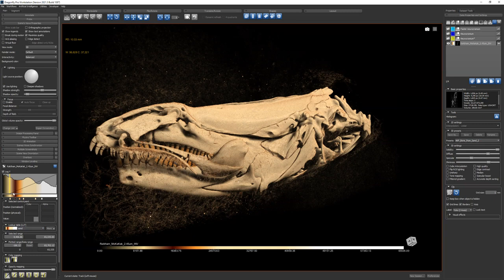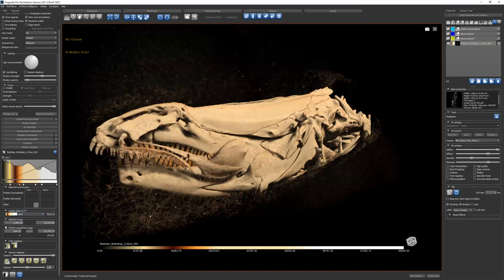But here's your not dense stuff. Here's your more dense things. And you can change all of these and just play with these until you figure out what you're doing. I always use this option, piecewise. It just gives you more control over the opacity.